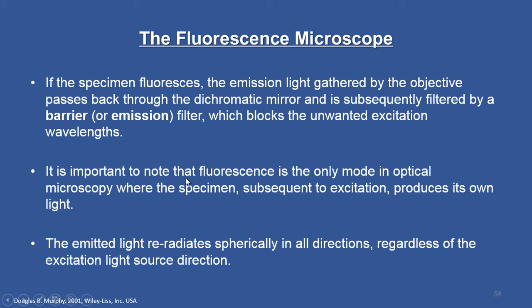It is important to note that fluorescence is the only mode in optical microscopy where the specimen, subsequent to excitation, produces its own light. The emitted light re-radiates spherically in all directions regardless of the excitation light source direction.